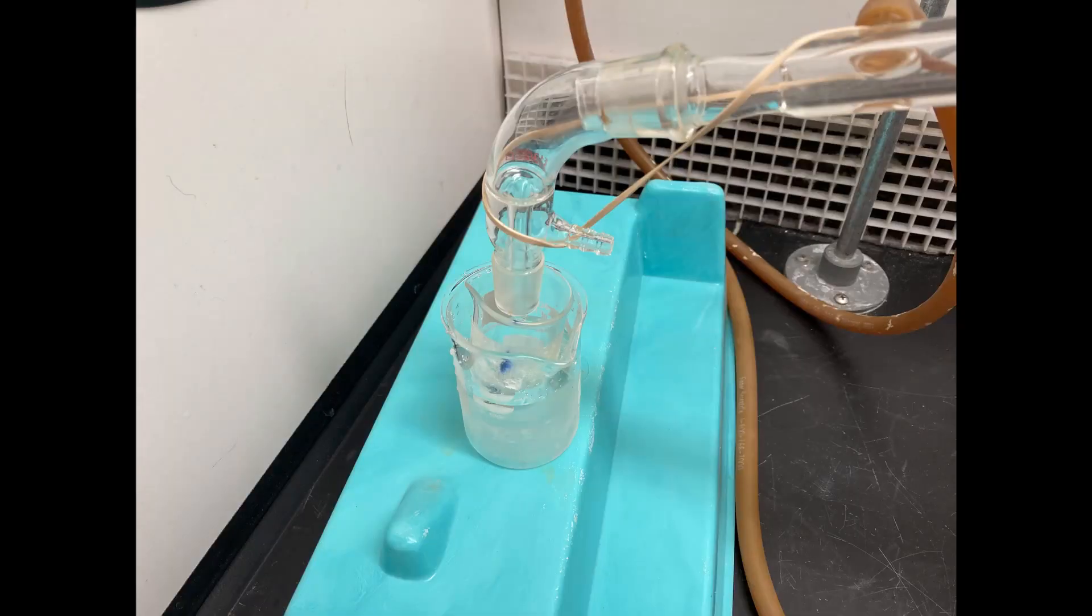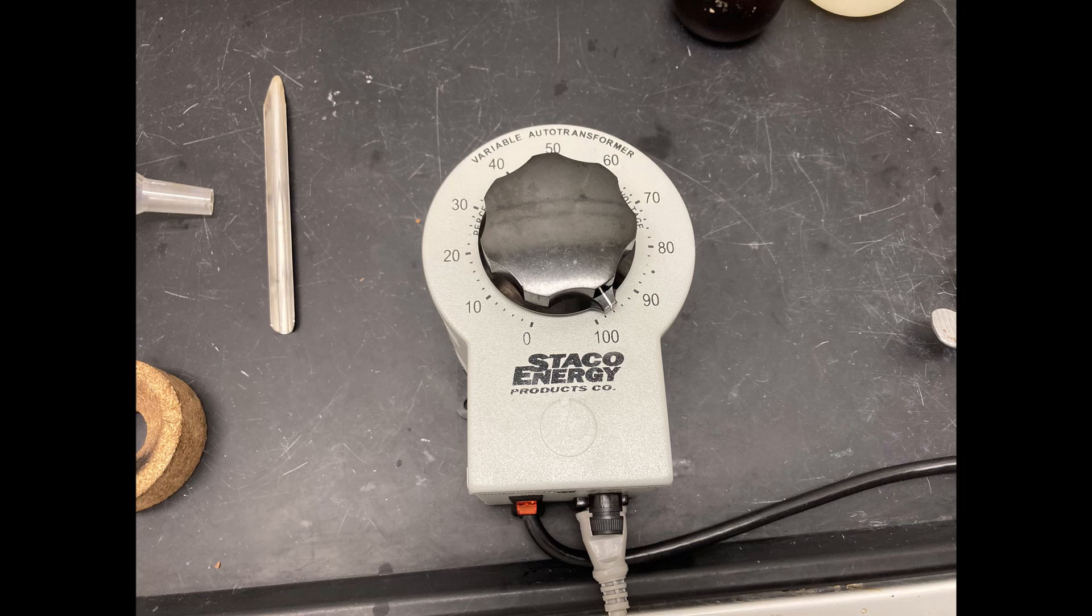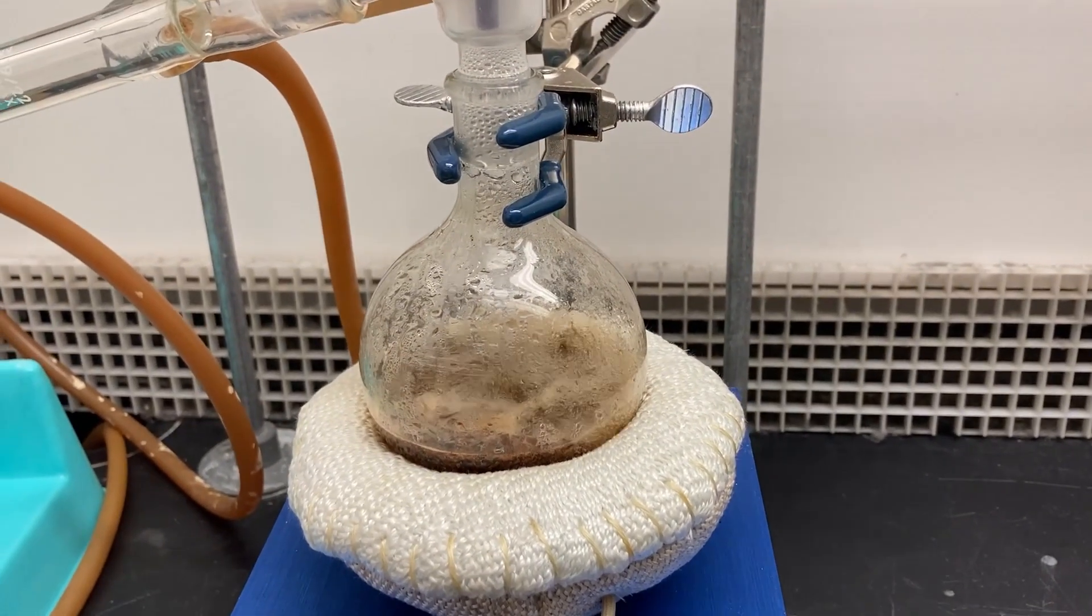Make sure your distillate is collecting in a beaker placed in an ice water bath. Set your variacs to between 95 and 100%. Your distillation should come to a boil after about 10 or 15 minutes of heating.